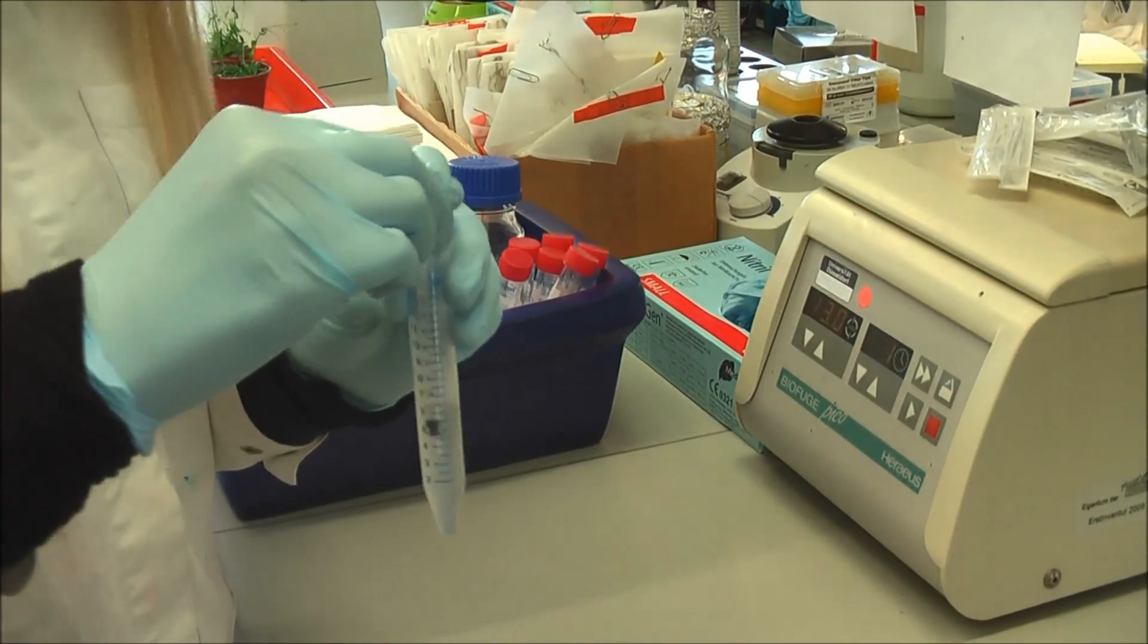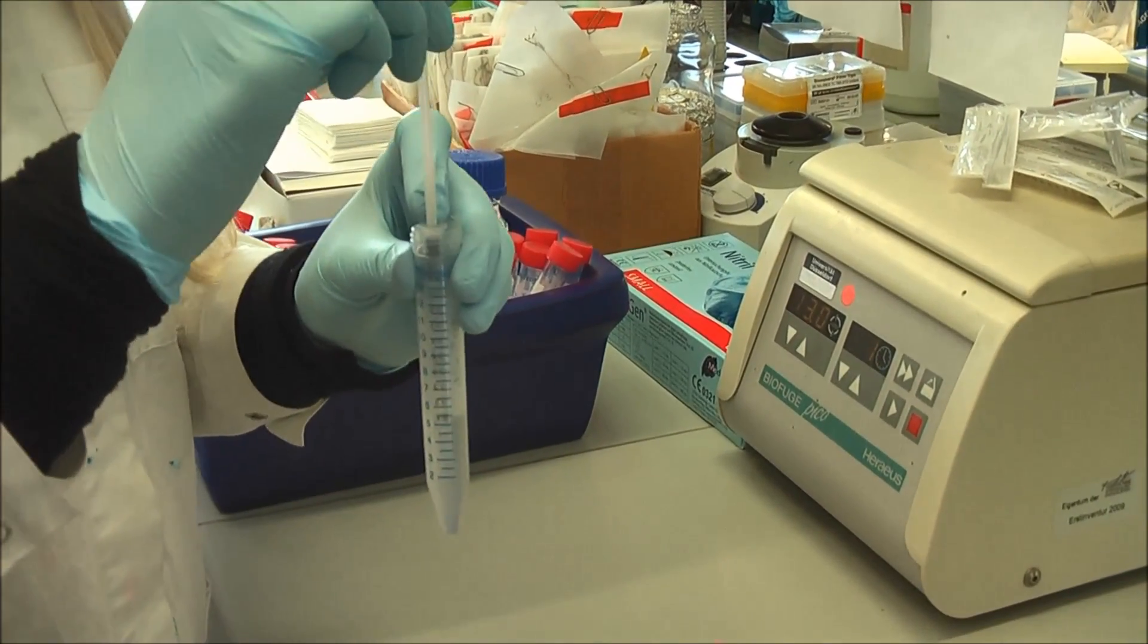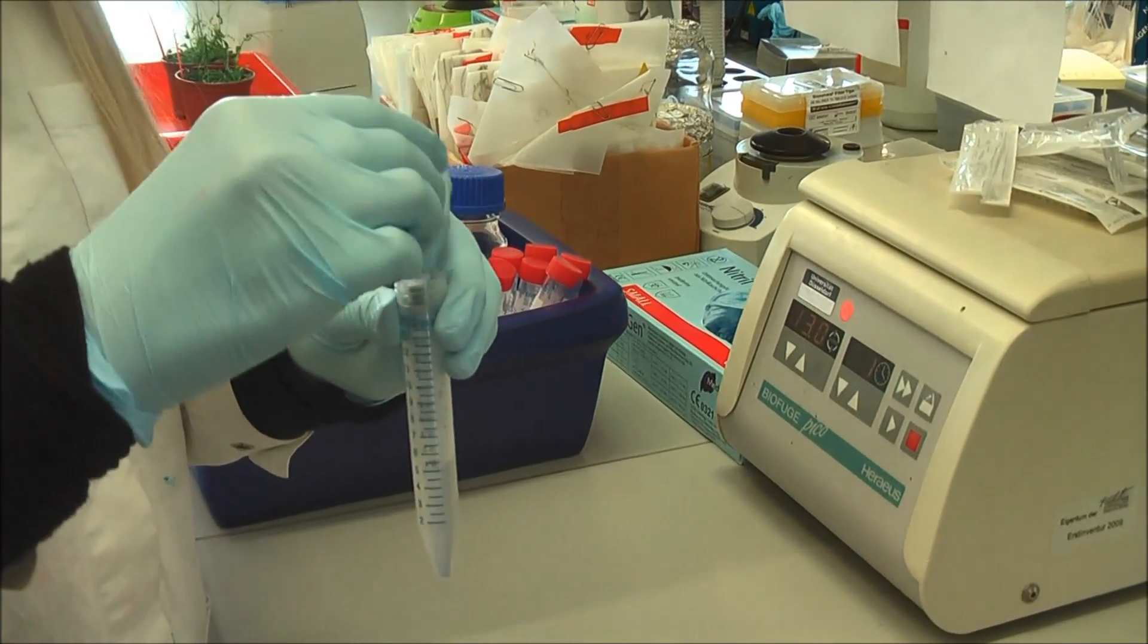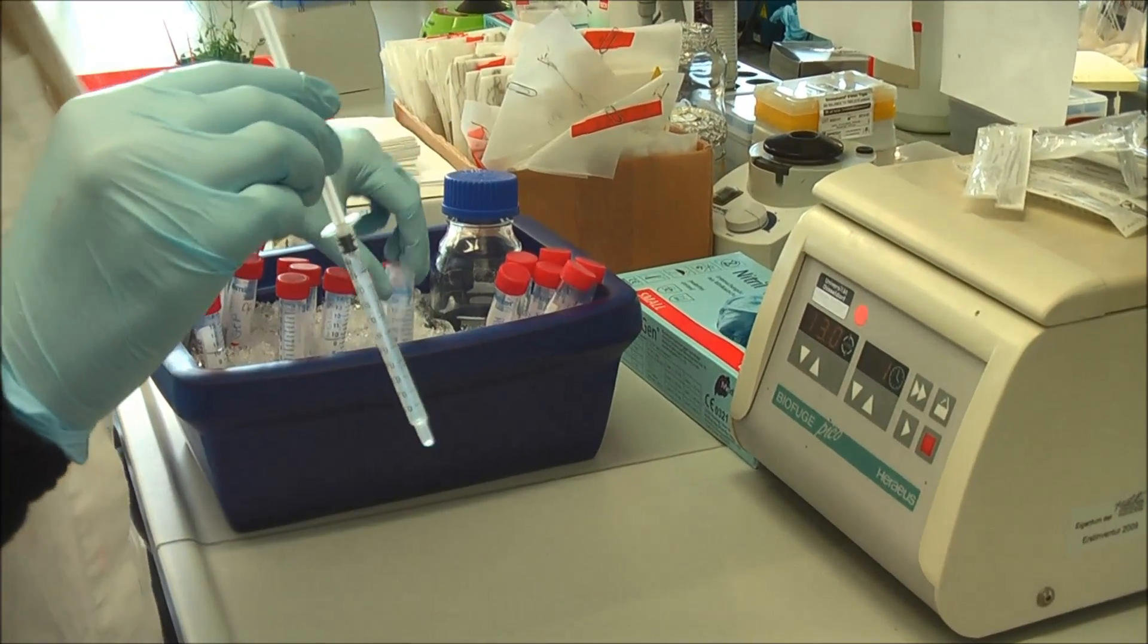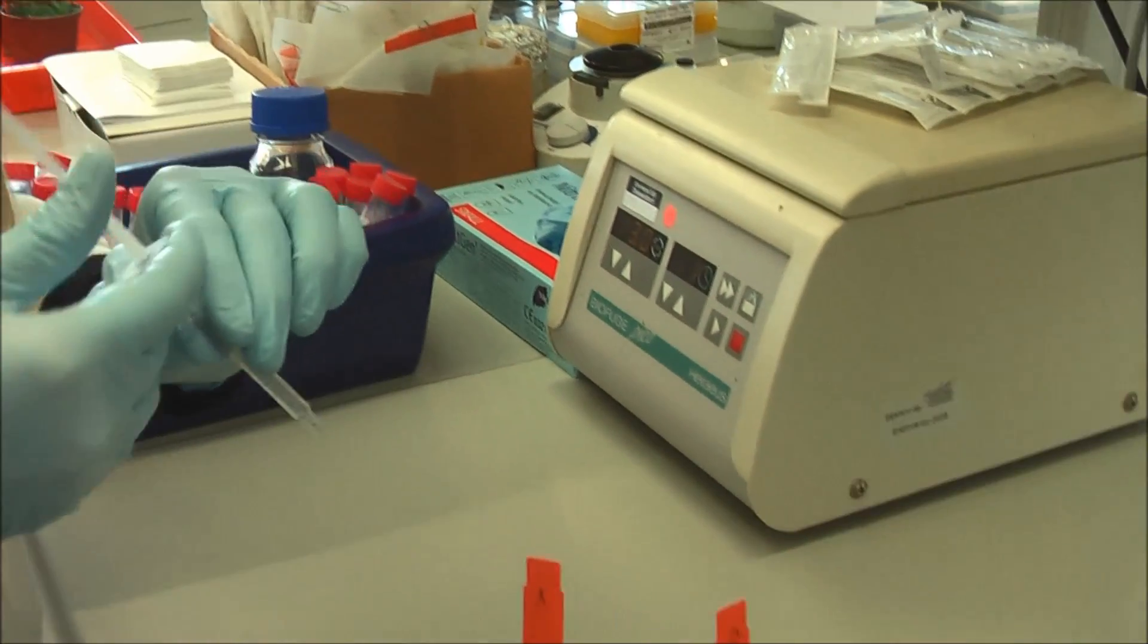Therefore, we inject agrobacteria into leaves of a plant, for example tobacco. Here the DNA is integrated and the tobacco plant can produce a protein from the DNA code.